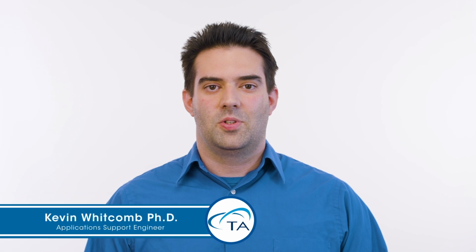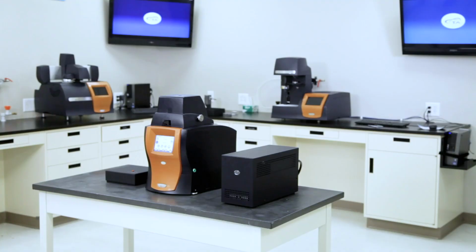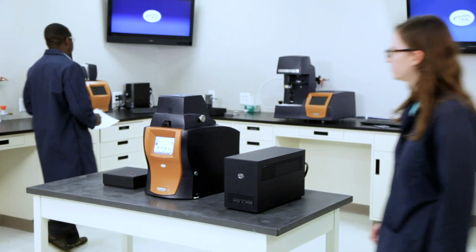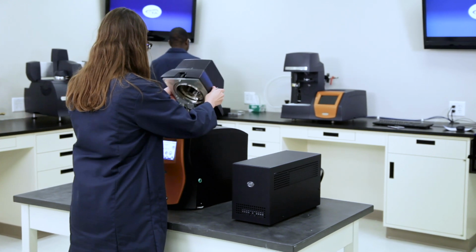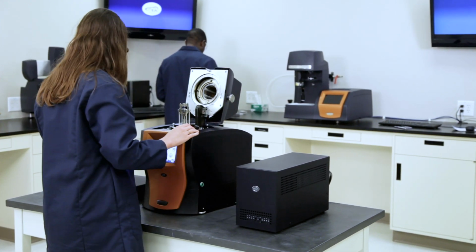In this tech tip, we'll show you how to analyze a temperature ramp for glass transitions on the DMA 850. The following tech tip discusses the determination of a glass transition for a polymer using dynamic mechanical analysis, or DMA.